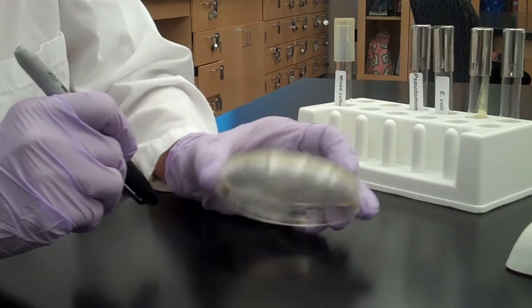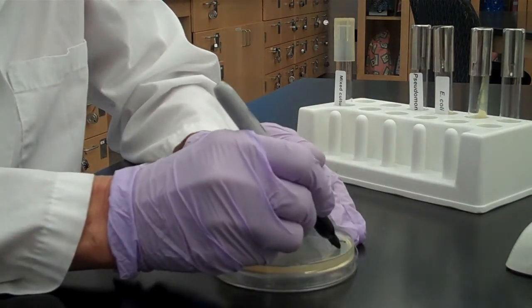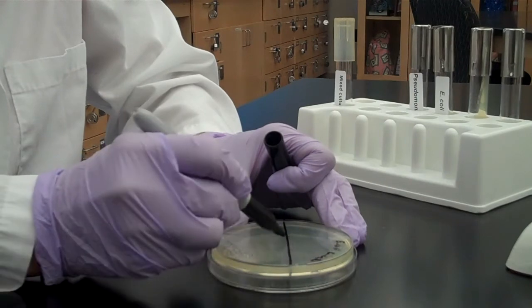Today we're going to demonstrate a streak plate. The goal of a streak plate is to isolate individual colonies of bacteria. We're going to begin by labeling the plate on the bottom side where the media is, and divide the plate into three sections.